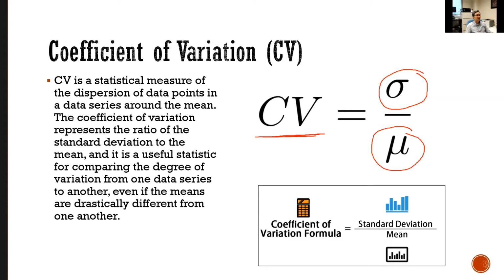Okay, so if you have a vector of data you want to compute, say for example you have a gene, and then across cells you have a different value of this gene's expression. You can compute the standard deviation for this gene across all the cells.